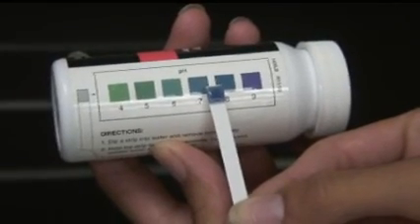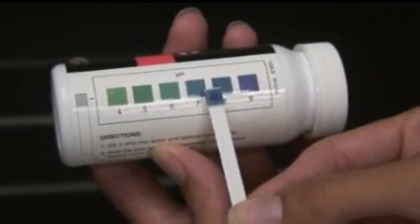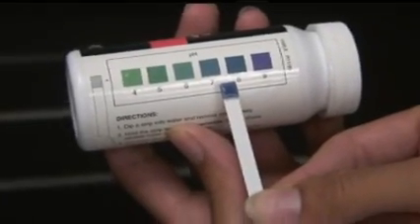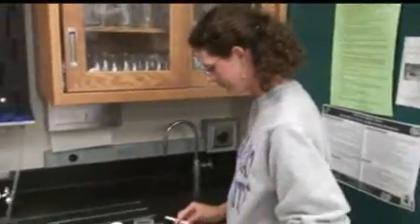For this sample, I would say it is around a pH 7.5. It's somewhere between the 7 and the 8, possibly closer to 8. Then, put the strip in the trash and record your pH measurement.